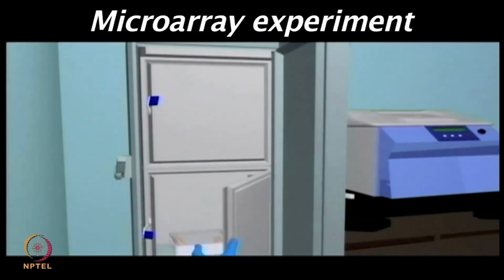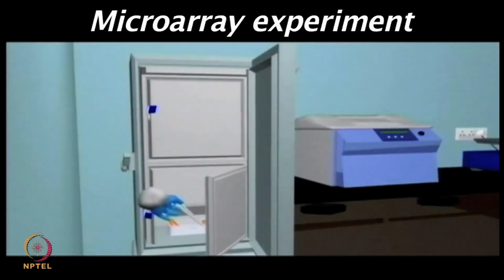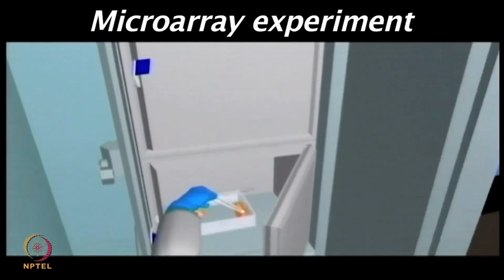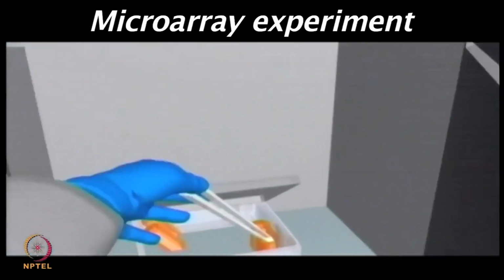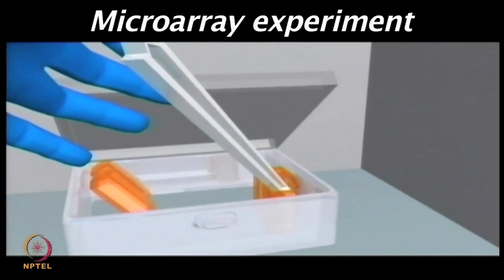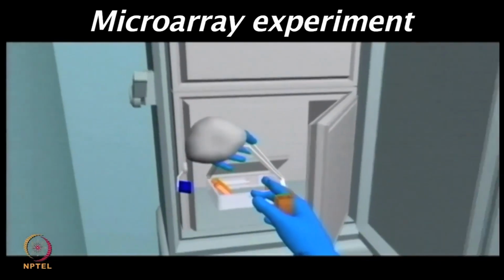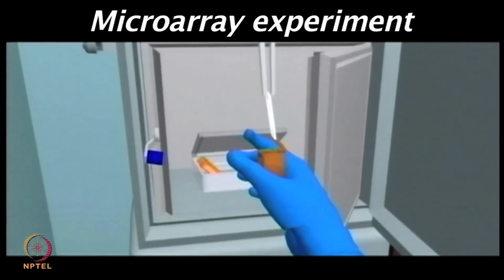So, there is only one difference between the cell free expression based protein microarrays and the cell based protein expression microarrays. In the cell free expression one, you have to add the in vitro transcription and translation machinery to synthesize the protein, and then the whole assay can be performed on the chip.